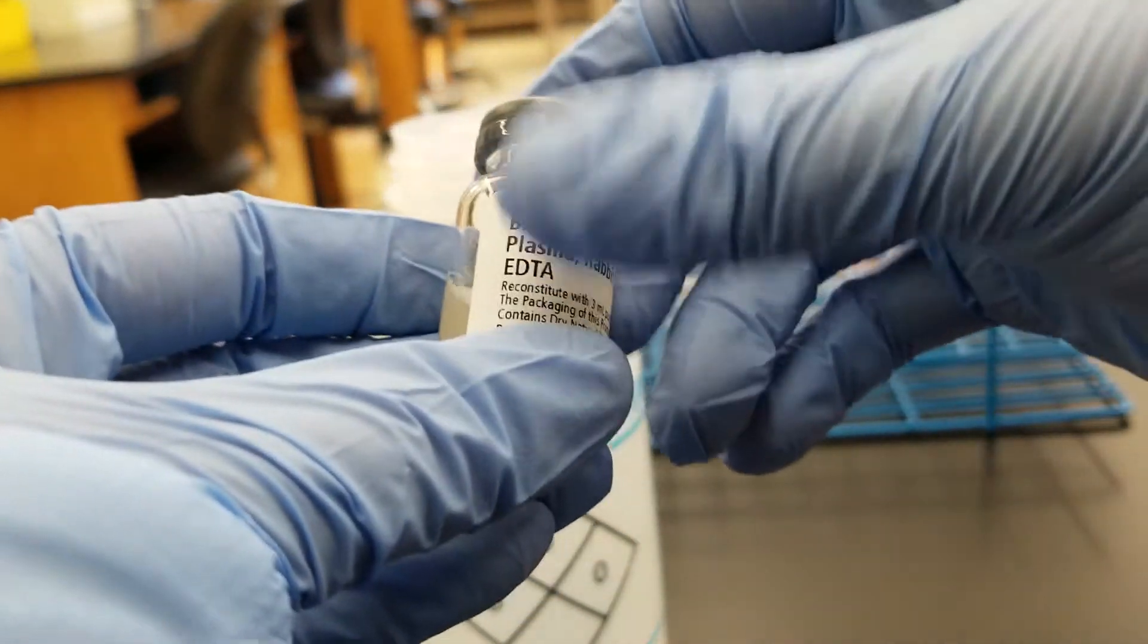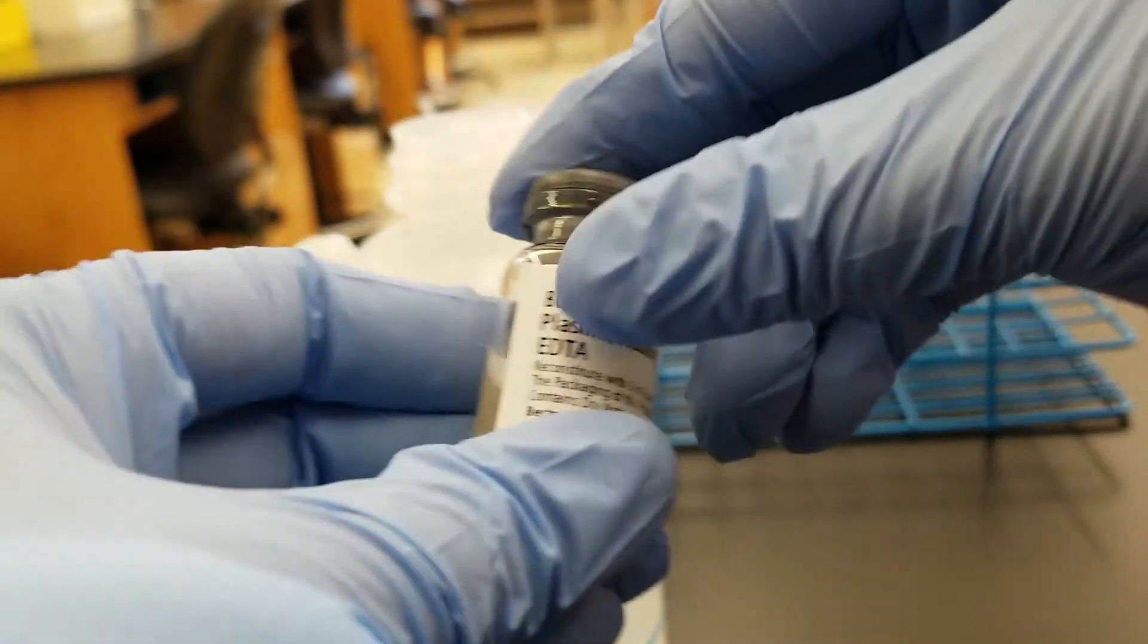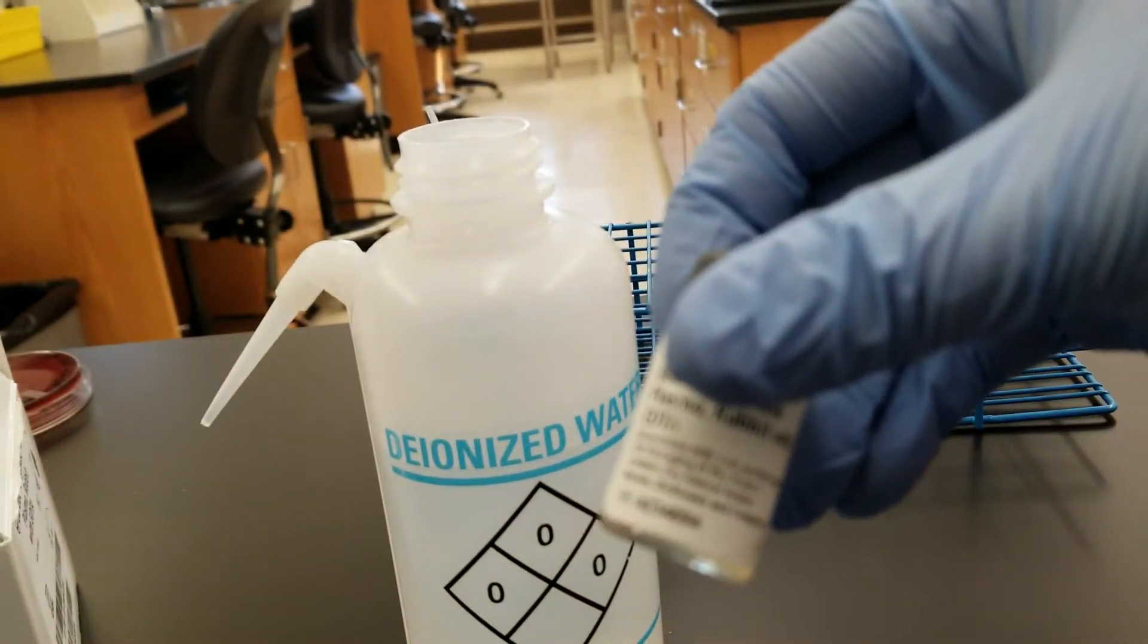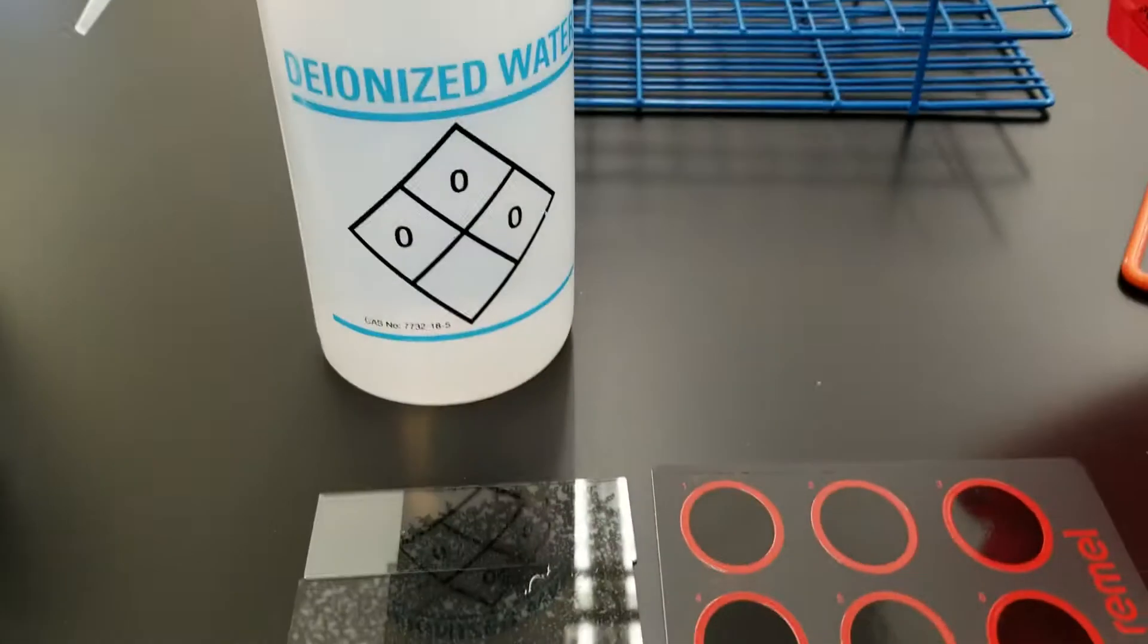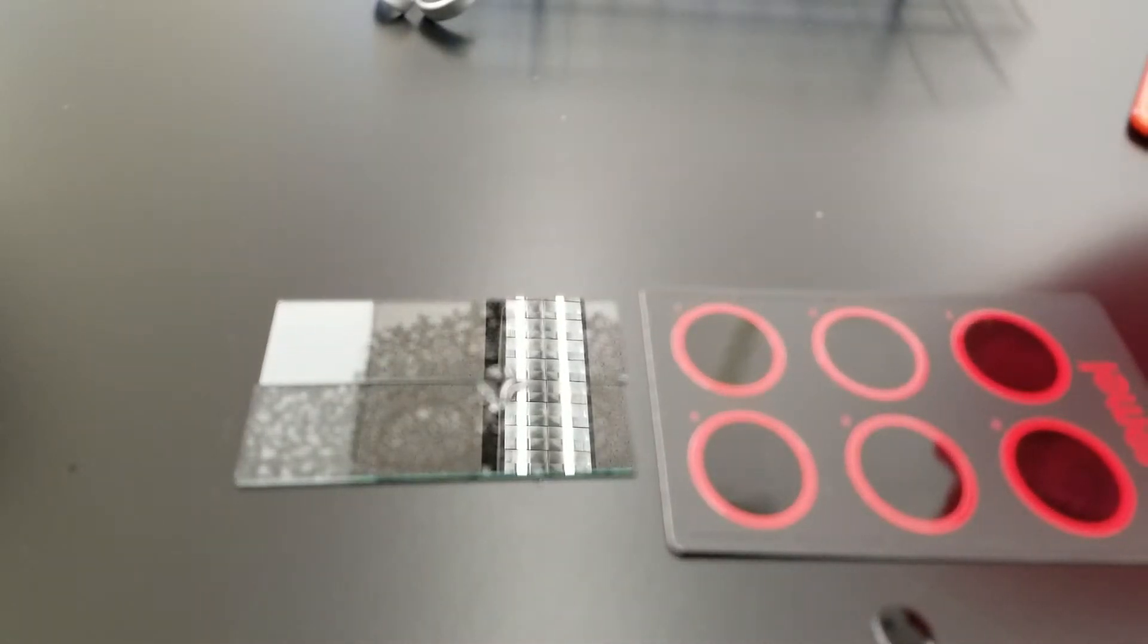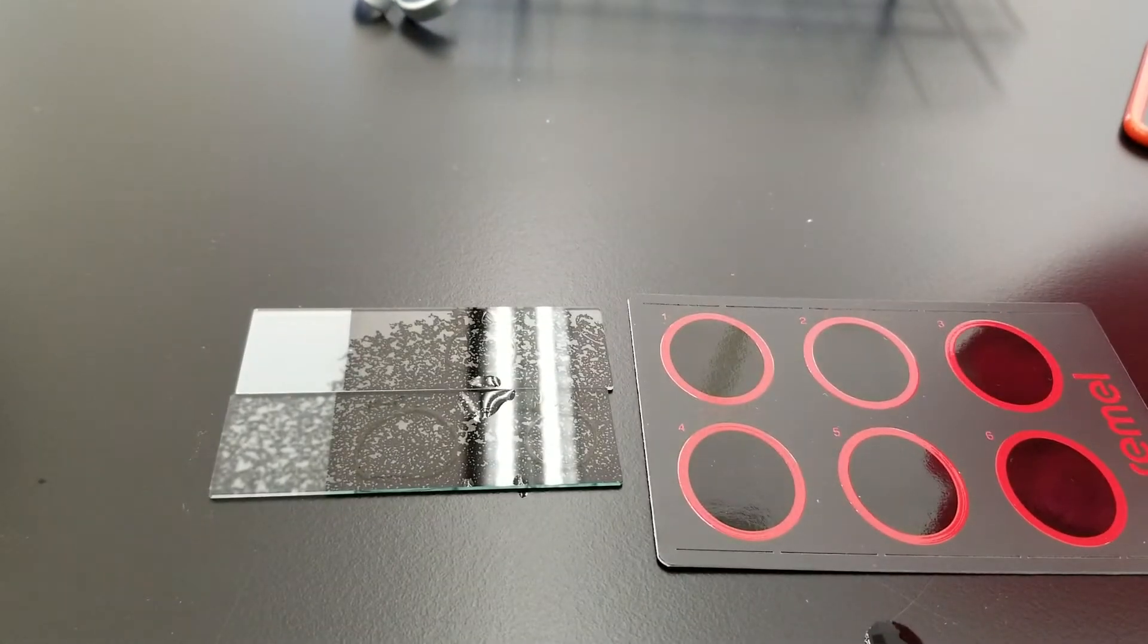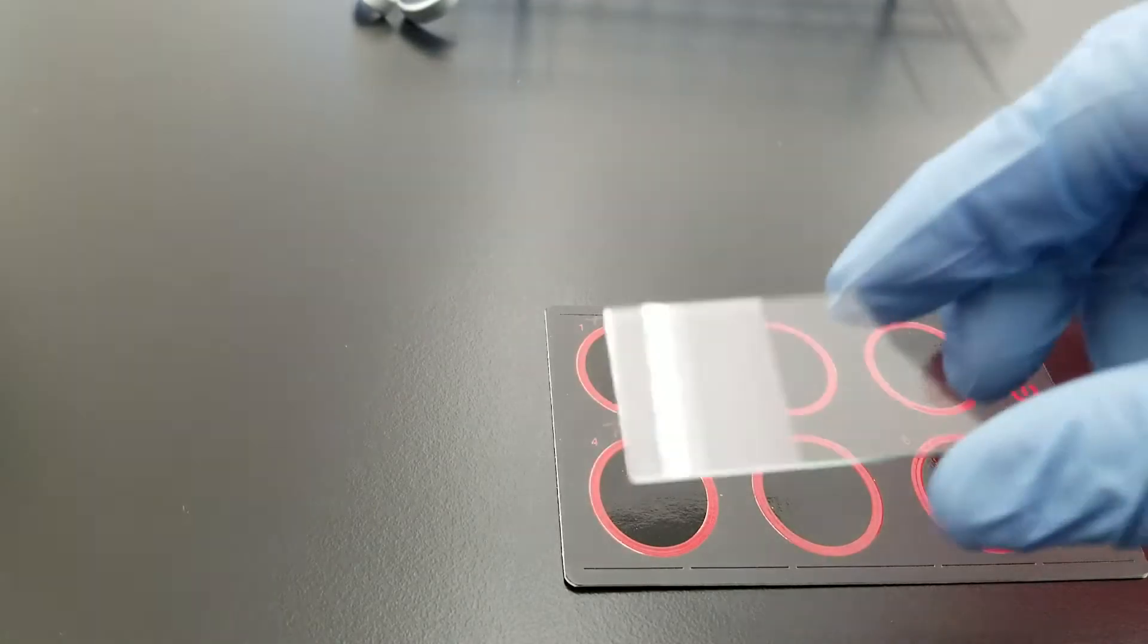You're going to label on the glass or the label, and you're going to label the date, the time, and your initials, and you let it set for 30 minutes. I already have one that is made up so we can go ahead and continue on with our experiment. But now this is wet, so I'm going to change those slides. You want to get clean slides.